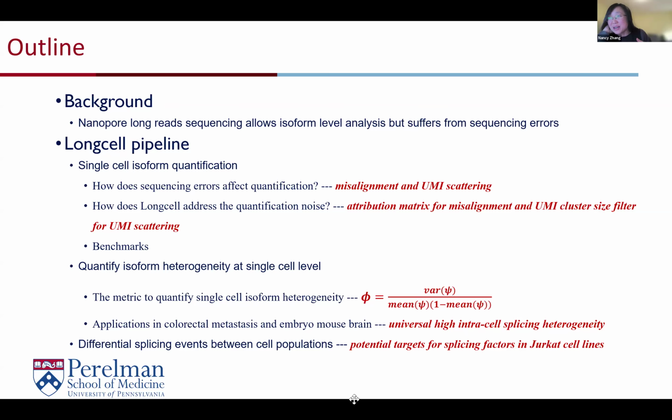Whereas alternatively, if you just want to look for cell state informative splicing or spatial domain informative splicing, there you could pool data across similar cells to increase your coverage, right? So it's more forgiving. So I think I haven't fully answered your question, but that's the best I can tell you about that.